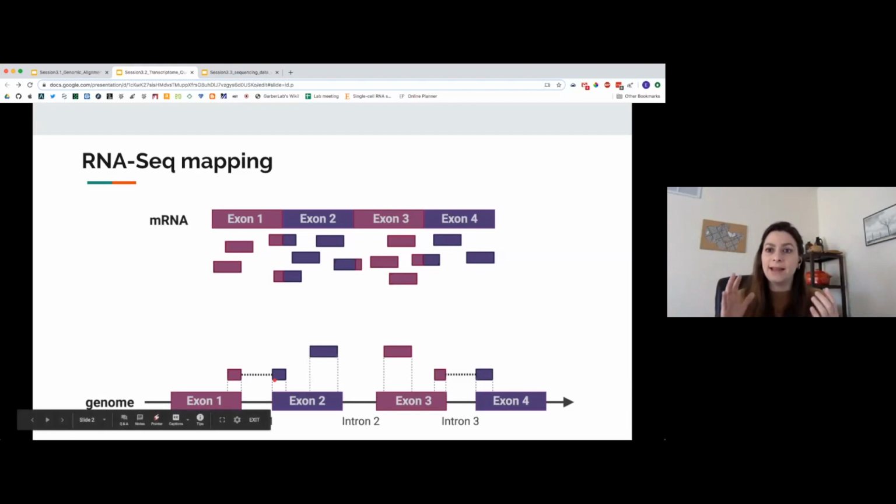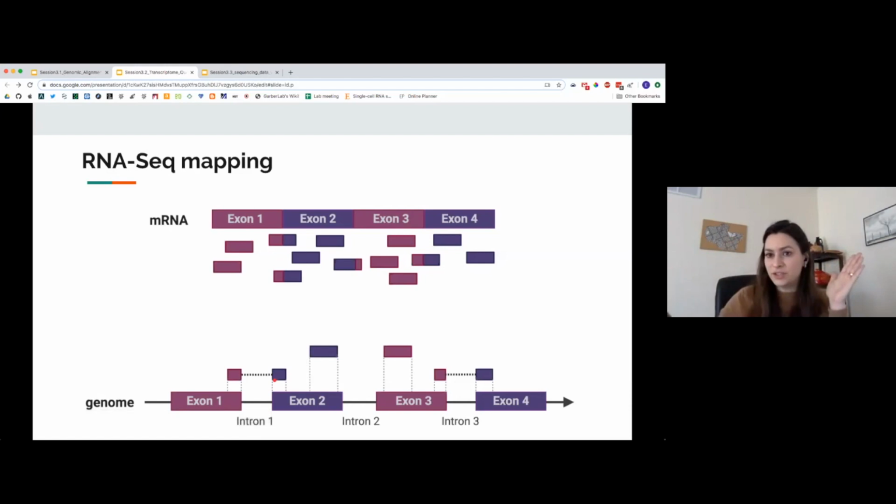So the hash indexing will serve for any base in the genome. It will have every base in the genome, what words, where you can find those words. But it's not the same as the splicing aware. Splicing aware means it's able to handle large gaps, like hundreds of kilobases large. And it's still capable of taking that second piece and finding a new position in the genome that could be hundreds of kilobases away that aligns the remaining of your read.